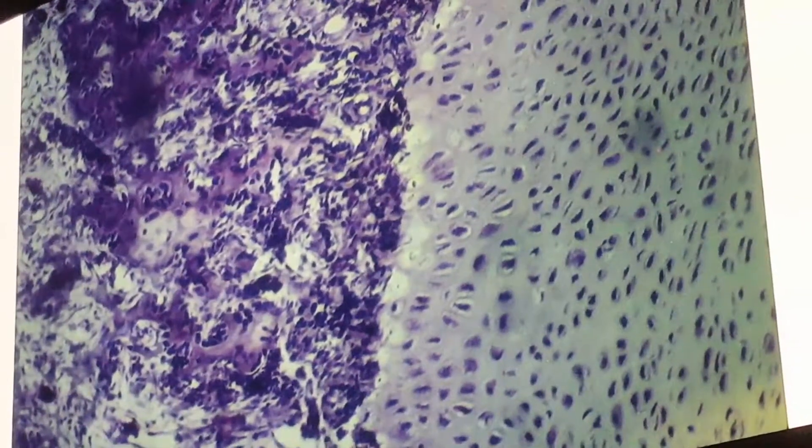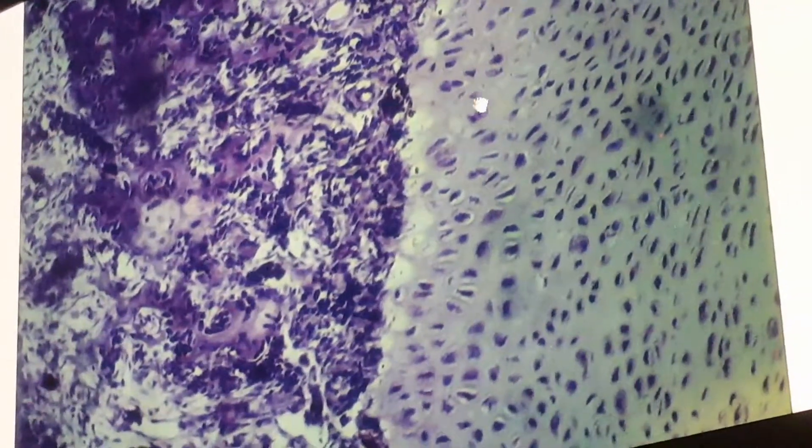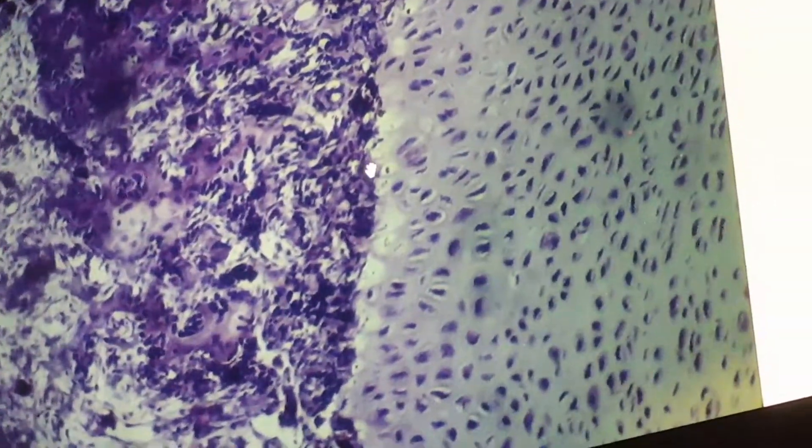The third zone is the hypertrophic zone. The chondrocytes are very large and the cytoplasm is full of glycogen.